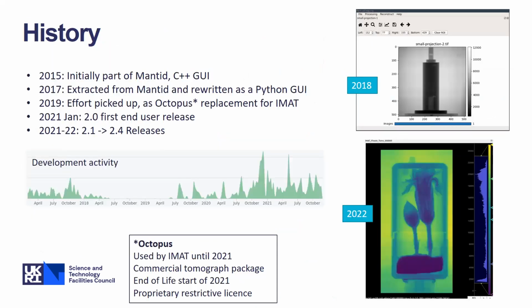In terms of history, it's a fairly new project, but it goes back a bit further in history. So there was initially some work that was part of MANTID, and then after that it got extracted out and became its own project.